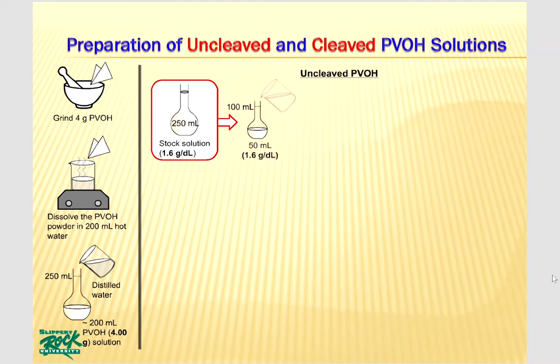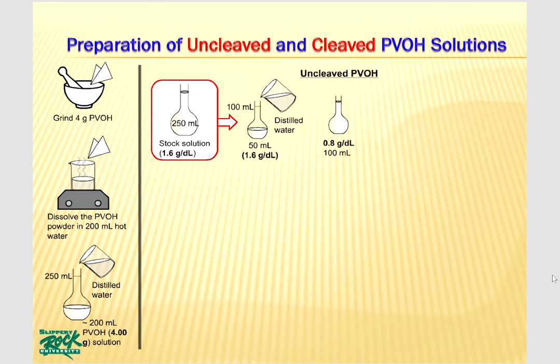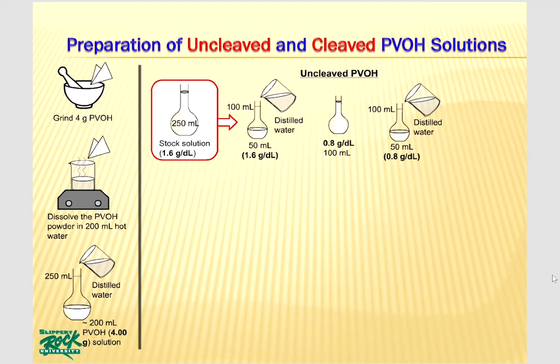The next step is to transfer 50 mL of stock solution into a 100 mL volumetric flask. Add distilled water up to the mark and mix by slowly inverting the solution a few times. The concentration of the new solution is half of the stock solution concentration, which is 0.8 grams per deciliter. The next step is to transfer 50 mL of this solution into another 100 mL volumetric flask, with the remaining 50 mL retained.